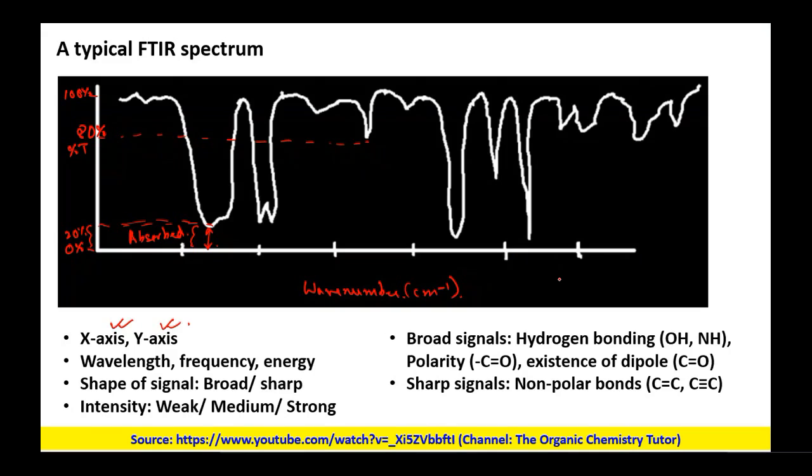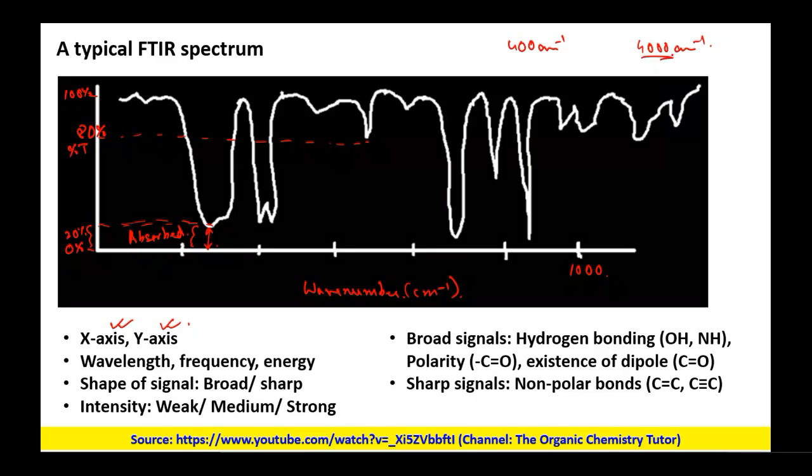Another important thing we have discussed is that we get these wave numbers directly from the region of around 400 or 500 centimeter inverse to 4000 centimeter inverse.